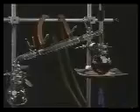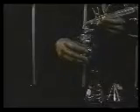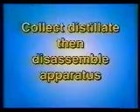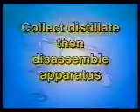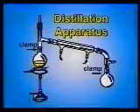Distill the liquid at a rate of about 1 to 3 drops per second. Collect the distillate until the upper end of the expected boiling range is reached, or until only a small volume of liquid remains in the boiling flask. Remove the heat source and transfer the distillate to another container. Disassemble and clean the apparatus as soon as possible after the distillation is completed. Let us review the steps to assemble the apparatus and carry out the distillation of a liquid.